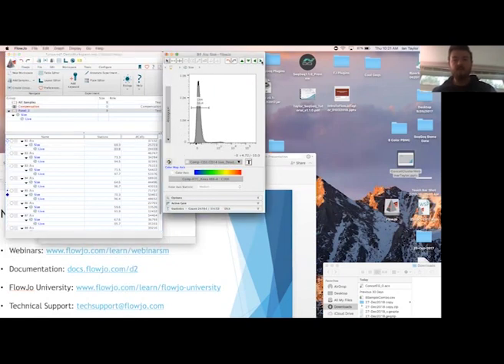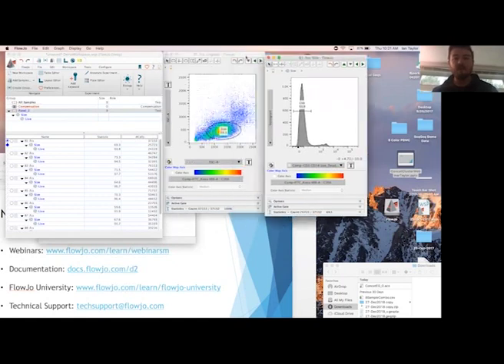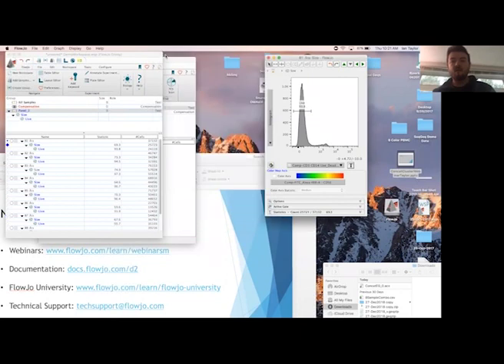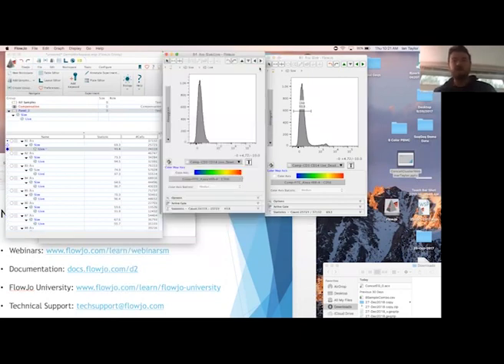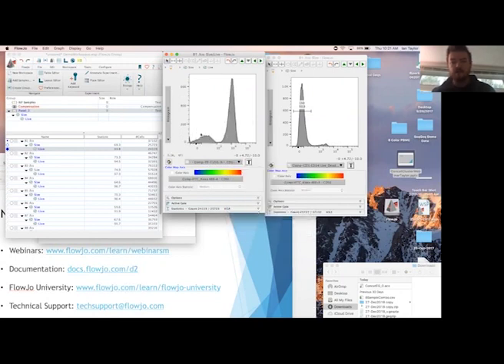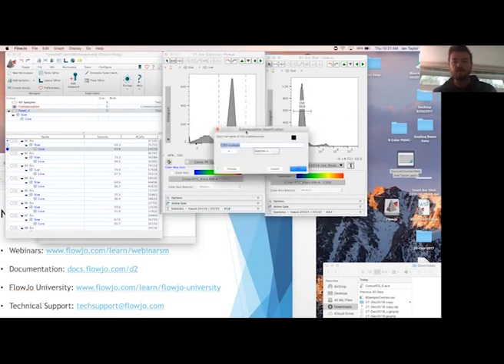Let's make sure that this gate is appropriate for those samples. It looked okay to me. I might even just check that the scatter doesn't deviate too much. Ooh, that one was a little bit off. Cool. Now, if I open up that set of live events, what kind of markers do we have here? I was wrong. There is no monocyte marker for this data set. That was the other data set. And maybe we'll go with T cells.